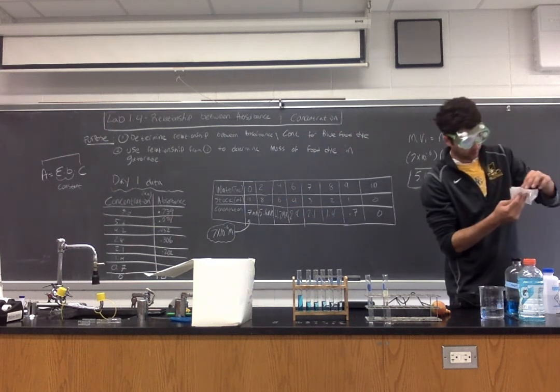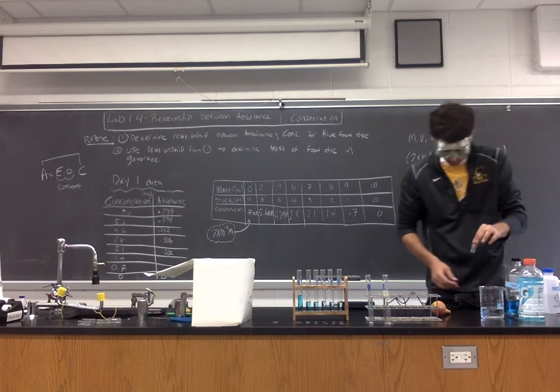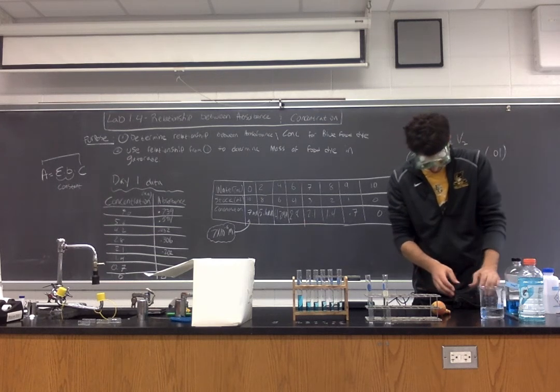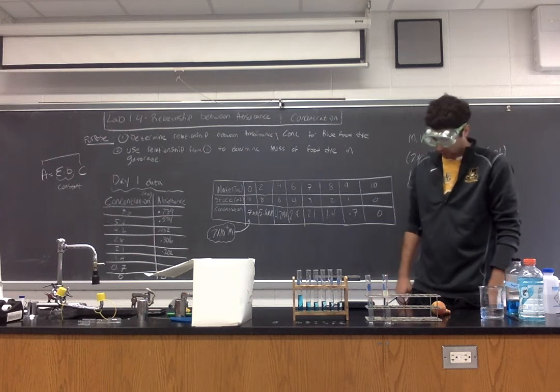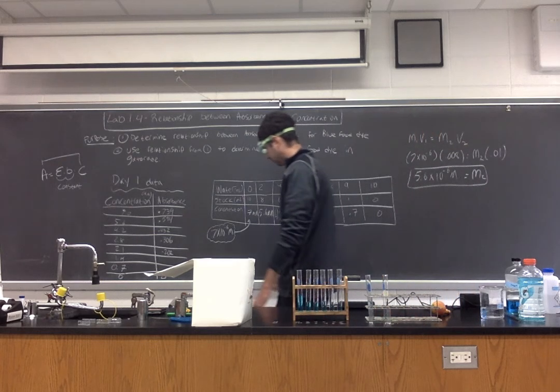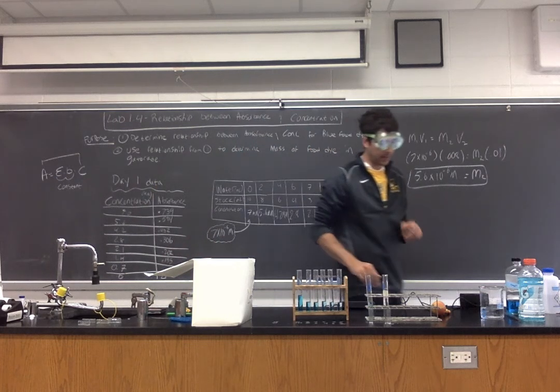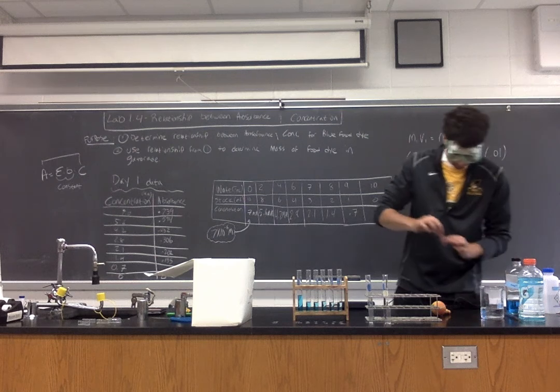Wipe off any smudgy fingerprints. And the last solution.